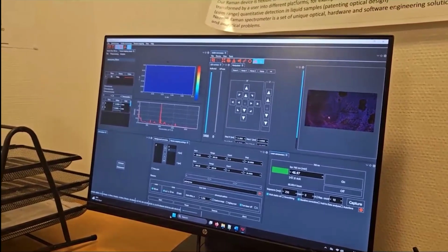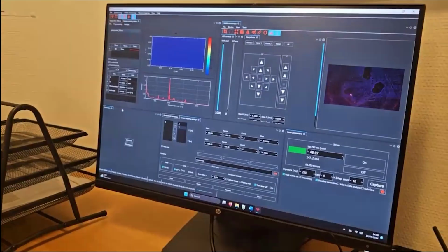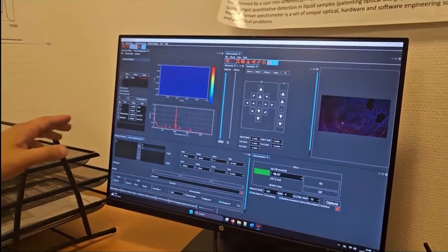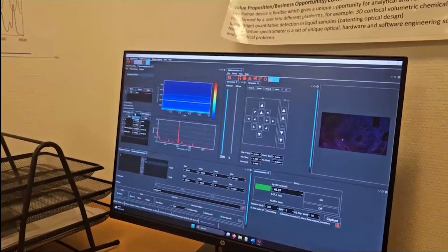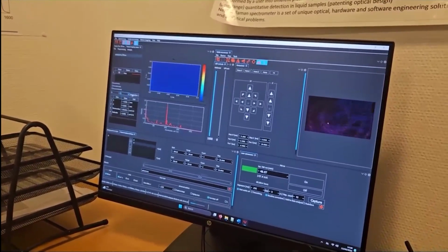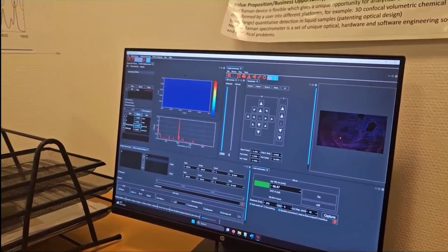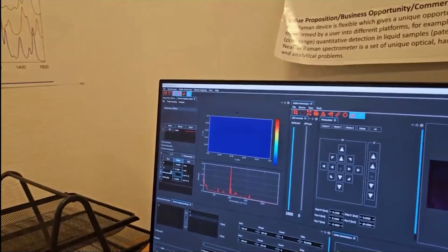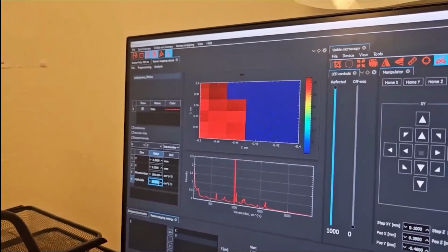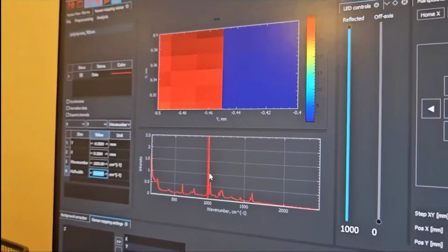Go to Raman Mapping Viewer. And as you can see here, there is a progress on the scan. So now it's 13%. Here's the Raman Mapping Viewer. We have to choose the proper coordinates. It should be, I believe, X, Y. And we choose the wave number, which would be, let's say, 1000, with a half width, let's say, 20. And it would be showing the intensity of this 1000 polystyrene peak as a map.